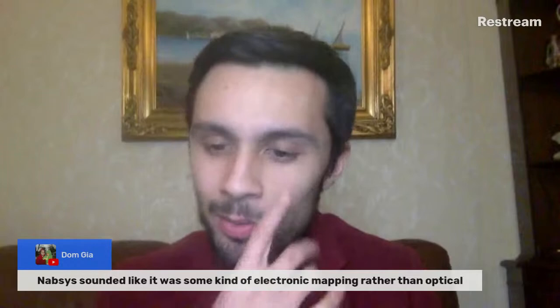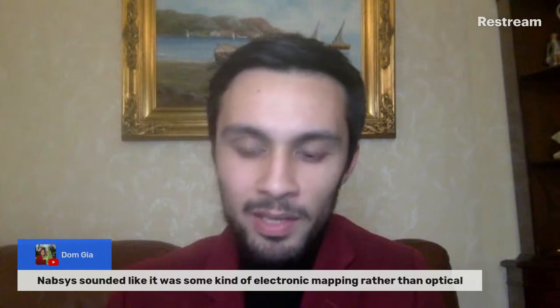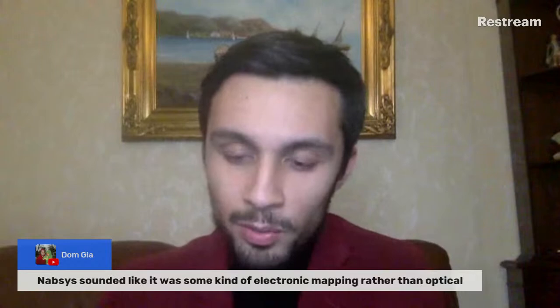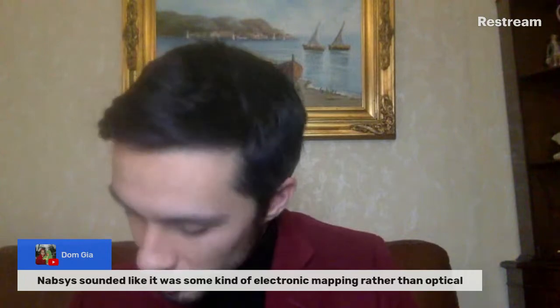Is it Nabsys that does the HD? I think it's called HD mapping, their technique. But yeah, that's a good place for me to explore. I want to look at all the competitors that are also in optical genome mapping or similar fields.